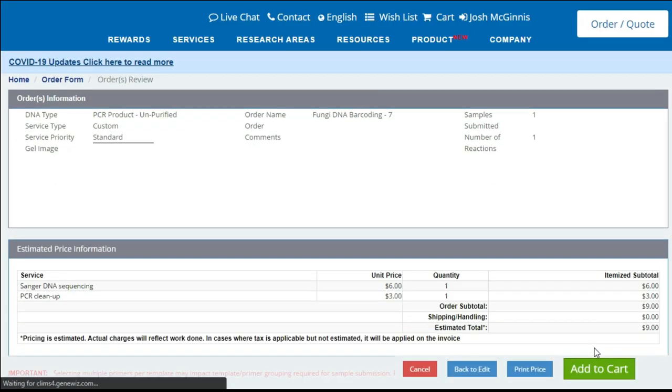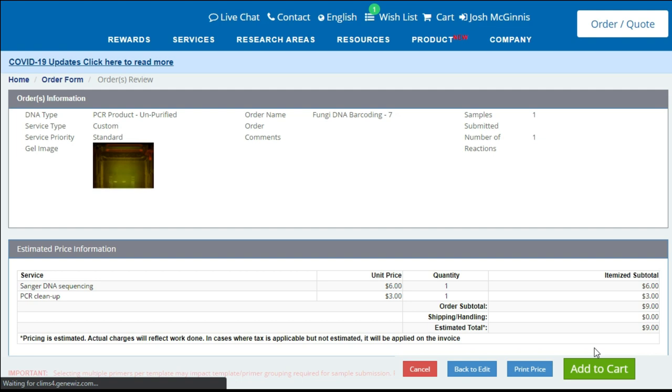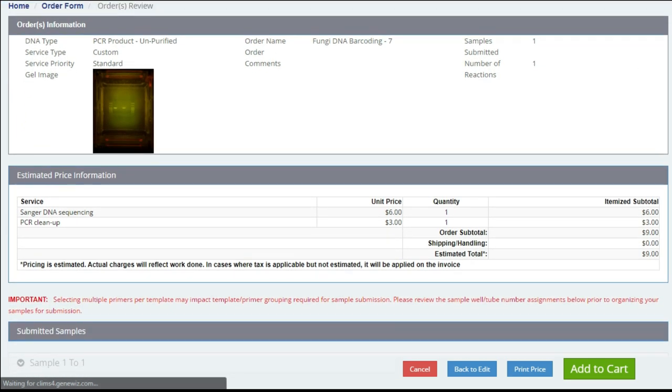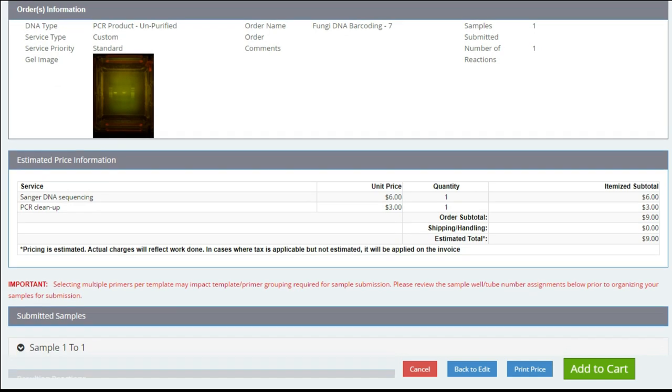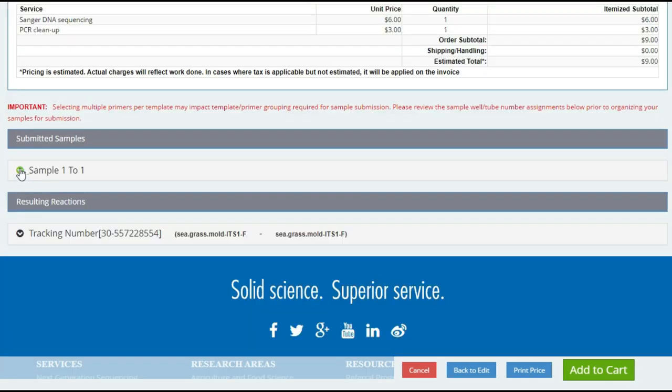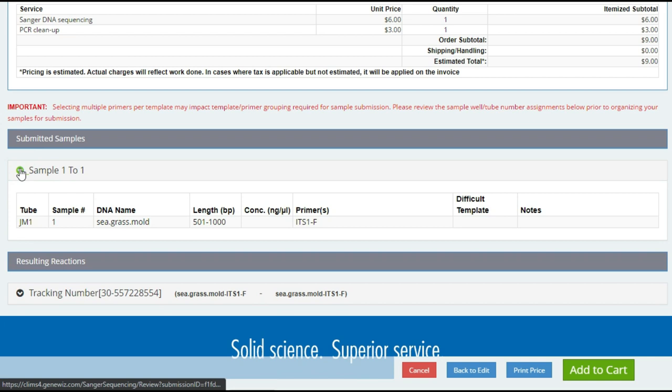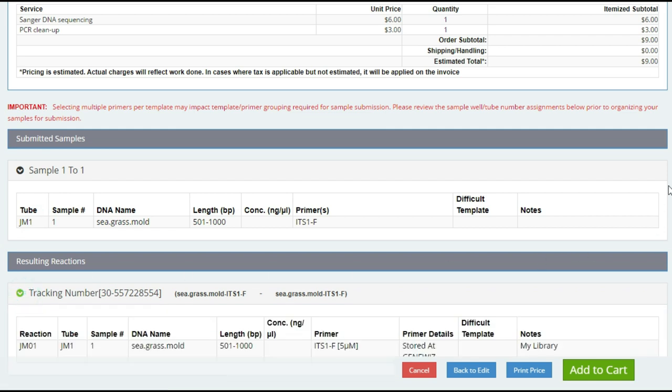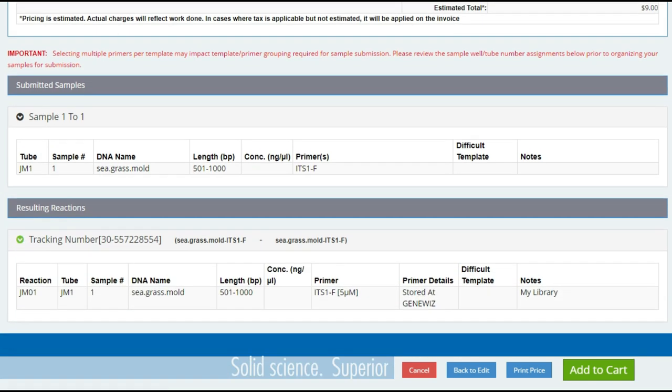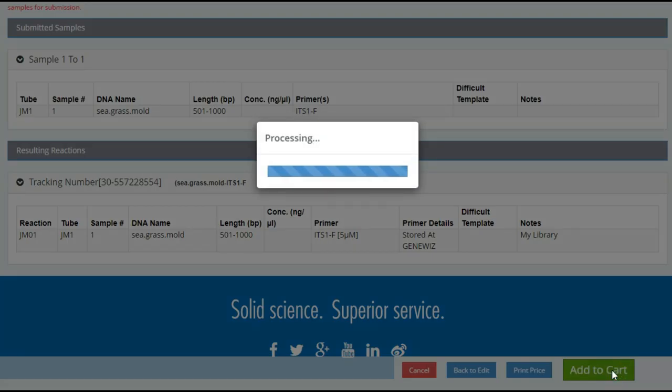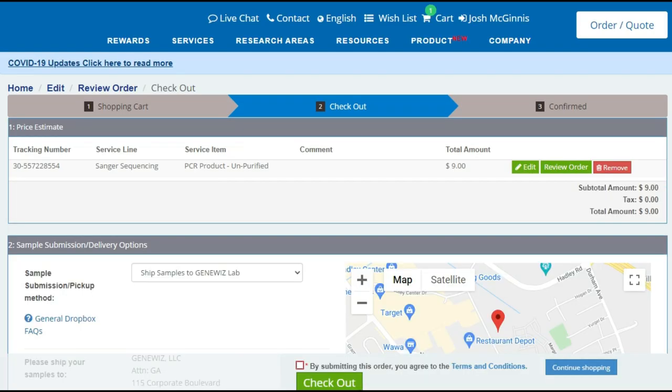So I'll click save and review. And now we can see the total price for our order. It's $6 per sample. And then we need to have them do a cleanup of the PCR product that we did in the first video. And that's an additional $3. So $9 per sample here. Further down the page, we can just confirm that we will be submitting one tube labeled JM1. And it corresponds with the seagrass mold that we are going to DNA barcode. We will then click on add to cart.